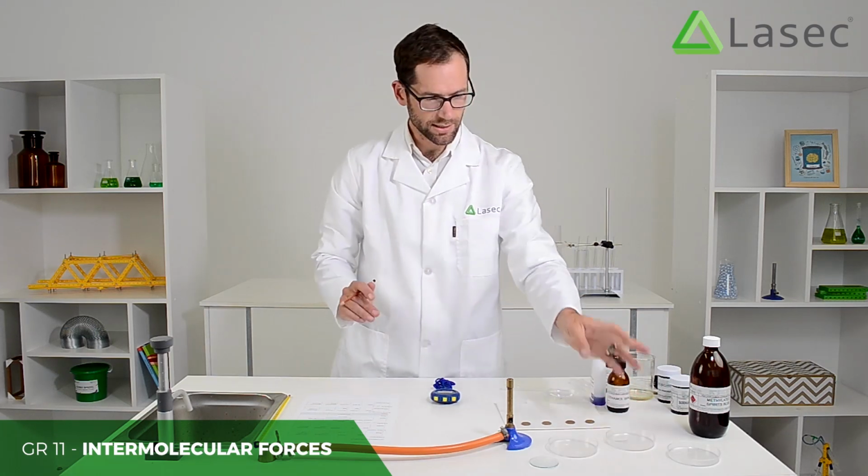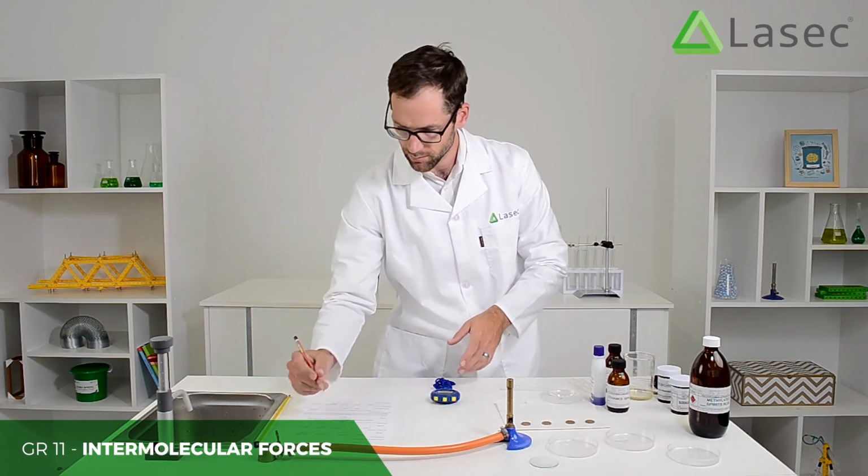There, my methylated spirits has evaporated. It took 2.5 minutes, 2:29.